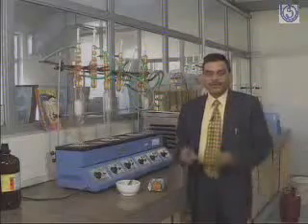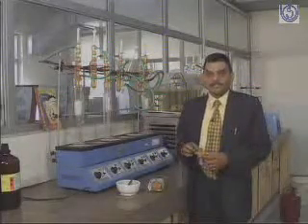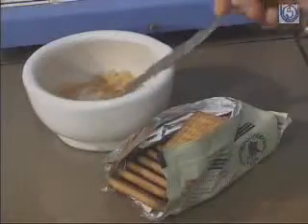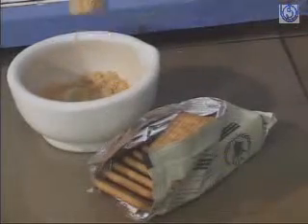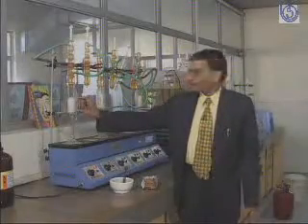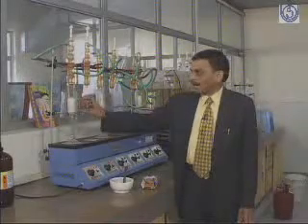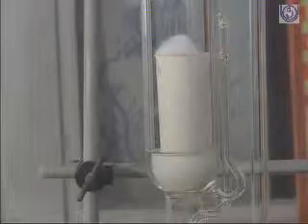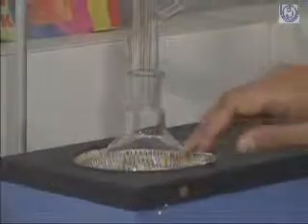Like this is a biscuit sample. We would like to know how much fat is in this biscuit. What we have to do, we have to crush the sample and make it into powder form, and this powder form sample we will put into this thimble, this white color unit, and we put it into the soxlet. This apparatus is known as soxlet. This is the flask, soxlet, and condenser.